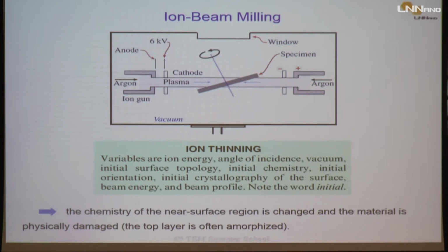it will work something like when you have glass, you use sand to make drawings in the glass. Everybody can imagine this. You understand? There is some sand. You accelerate the sand and you corrode the glass to make drawings and so on. It's the same idea here.